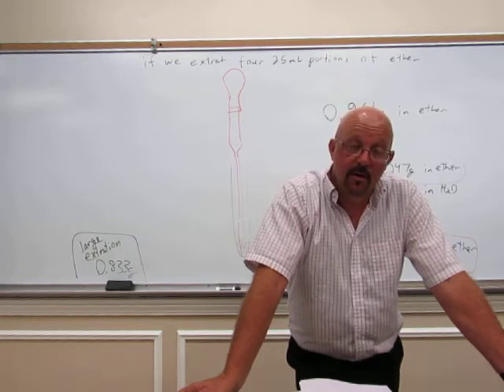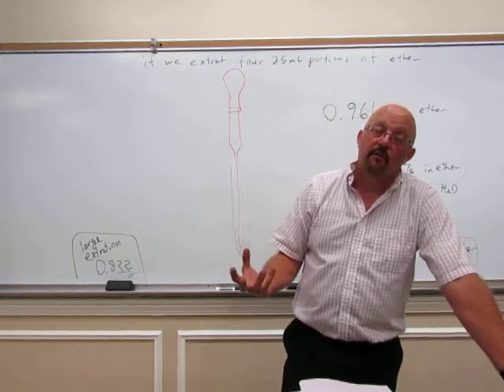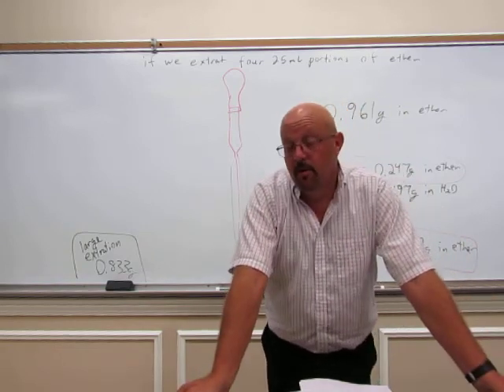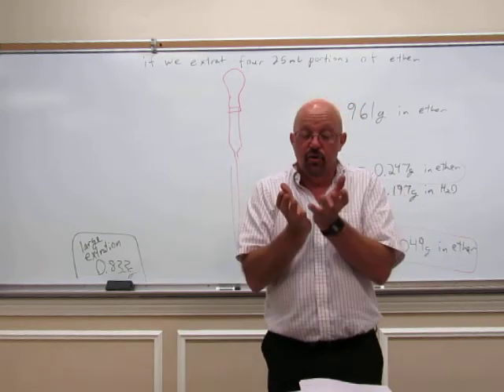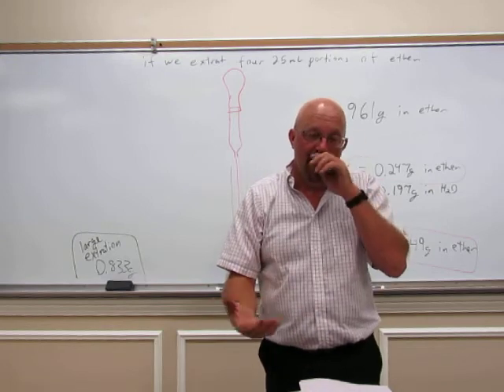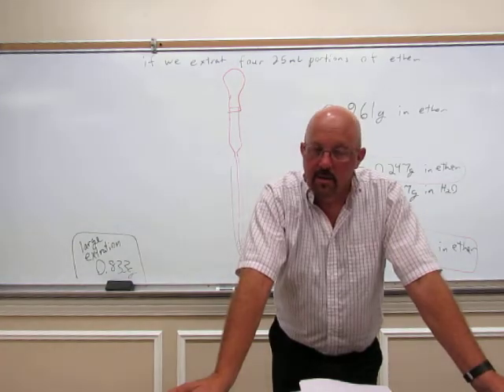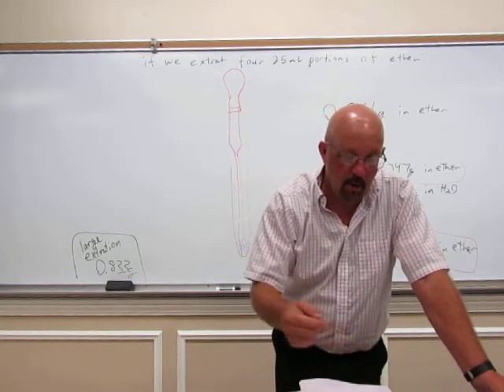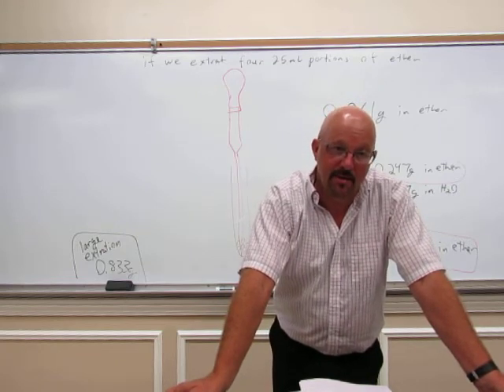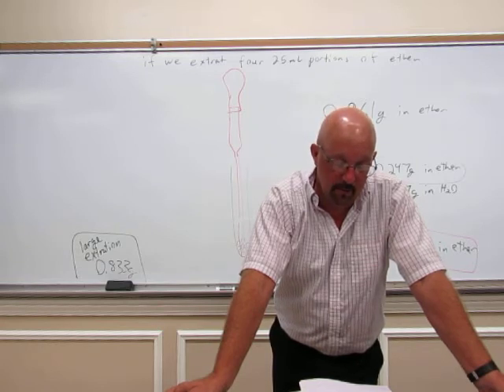The benzoic acid that it extracted should be left behind, so you should have a solid left in your Erlenmeyer flask when we're finished. You'll take and weigh the flask. Once all the solvent's gone, no more liquid, just white, solid benzoic acid left behind in the flask. Take your boiling stick out, weigh the flask, and then subtract the weight that you had earlier of the empty flask. And that will give you the amount of benzoic acid that the dichloromethane extracted when you subtract the two.